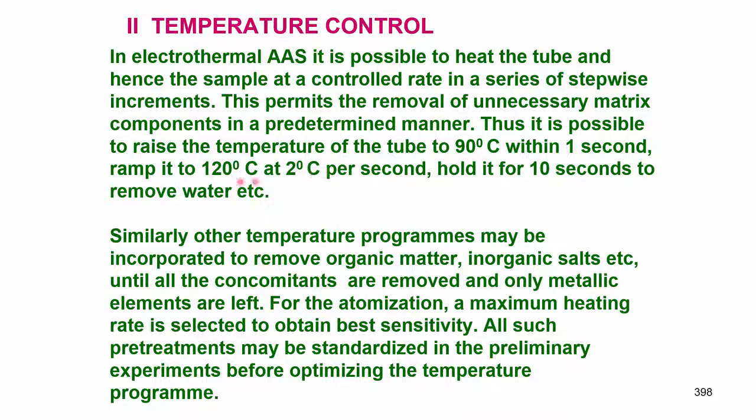Okay. So, I can heat it to 90 degrees within 1 second and then raise it to 120 degrees at 2 degrees centigrade per second. That means, from 90 to 120 degrees I can heat it in 15 seconds.